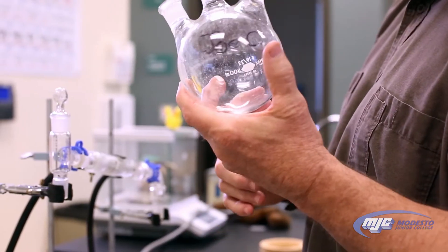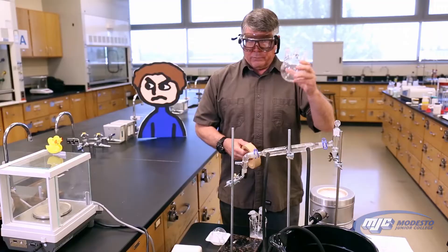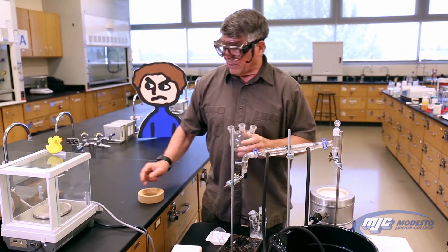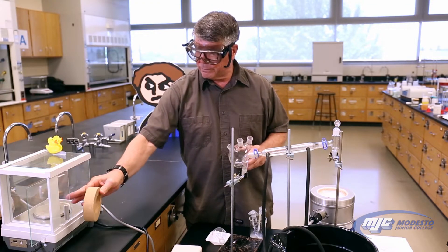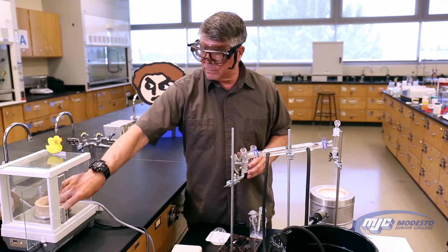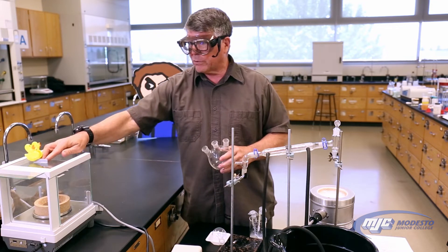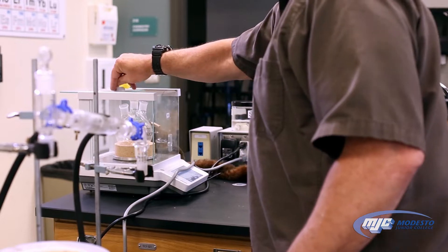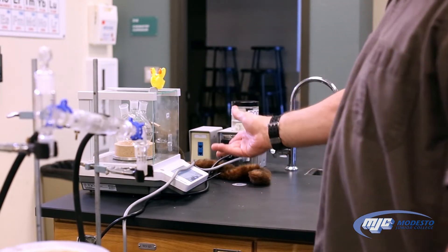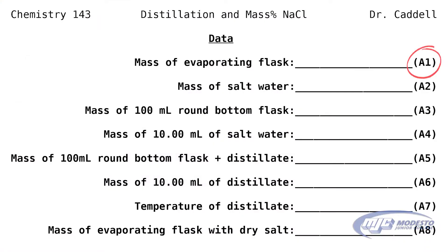I have my name on here and you're going to have your name on there. The first thing we need to know is the mass of the empty flask with the boiling chips in it. To weigh the boiling flask, we're going to use a cork ring, put it on the balance, and tare the balance. Now the balance says zero with the cork ring on there. Put the flask in and we're going to record that — that's the mass of the empty flask, which is going to be A1, the evaporating flask. Three places past the decimal, little g for grams.